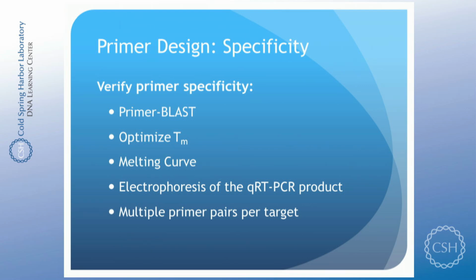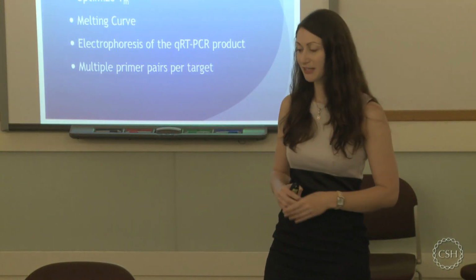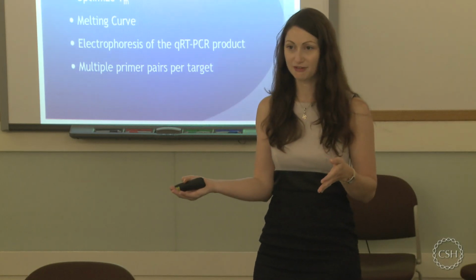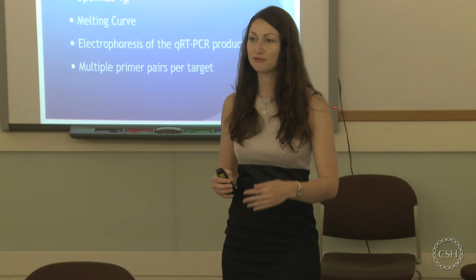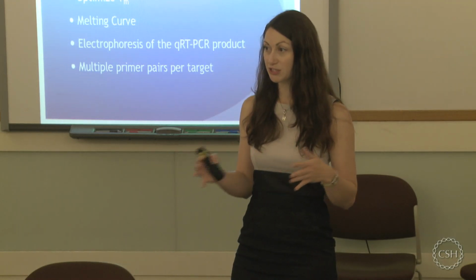Another point, and that's coming back to the melting temperatures, this is pretty much out of fashion nowadays. No one is optimizing melting temperatures anymore. I have done it a lot actually, definitely in my undergrad and also in my grad work. So you actually could run a gradient if your PCR machine is suitable for a gradient run, of course it is. And try different temperatures from 55 to 65, for example, is a common range, and see if your primer is specific or if it amplifies your target at a certain temperature range better than in another one.